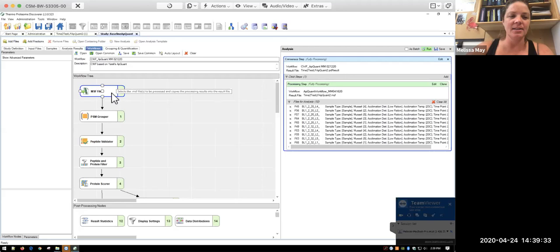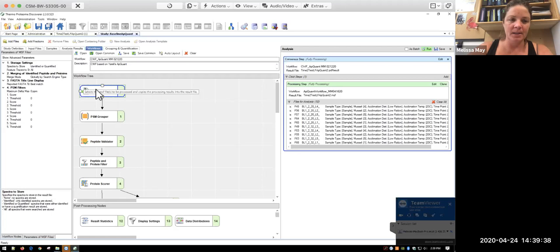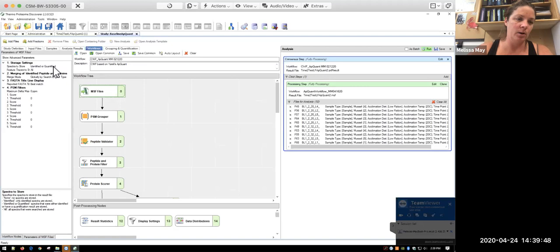In terms of the consensus step, there's not a lot that we change here. So for the MSF files, this is just taking the files from that previous step and going to continue with the processing. And so it's going to go with anything that was identified or quantified. And then basically everything else is going to get thrown out.